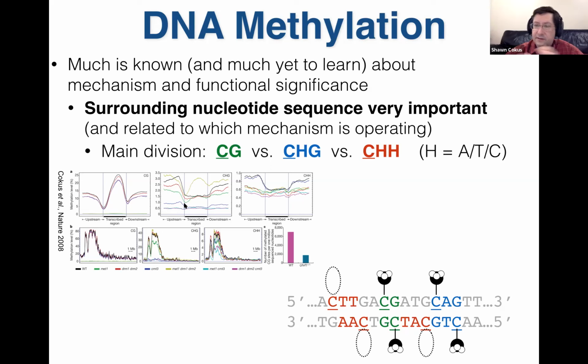So you know that these various genes we're knocking out are playing roles in the methylation of those specific contexts. Down here in the corner, in the cartoon at the bottom right, we've colored the contexts. So in mammals, of course, CG is the one mainly of interest.